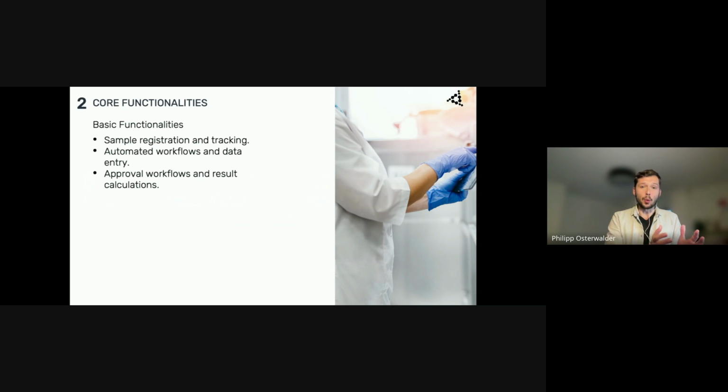There are even more if you think about it. We have a LIMS and we use a report generator, a test report generator with the certificate of analysis, or we have a master data module, which is available to manage articles, test methods, and test plans with different specifications and versioning. That's also true and is one of the core functions, or should be one of the core functions of a LIMS. But we're just focusing on the really needed and basic functionality of a LIMS.